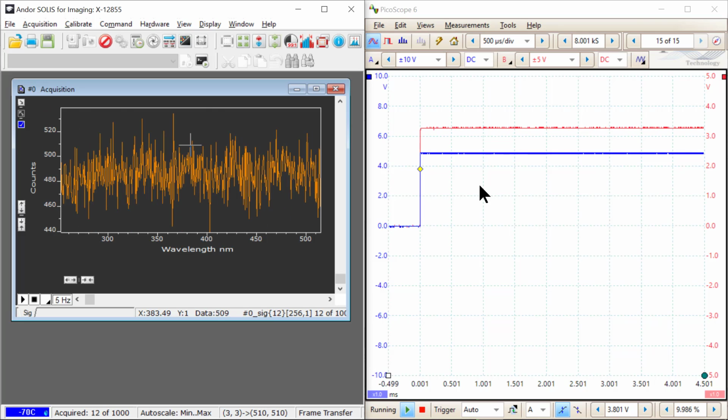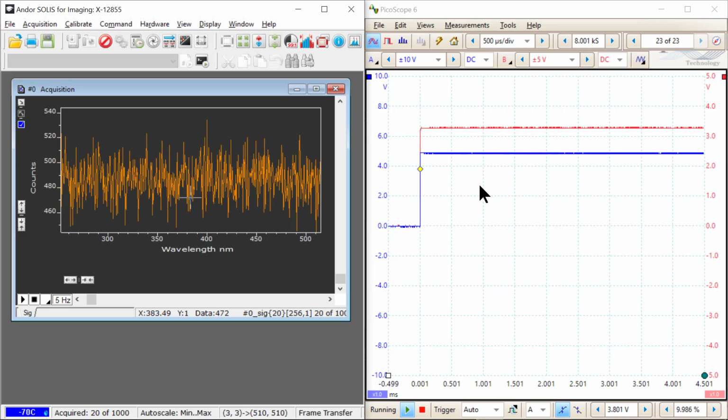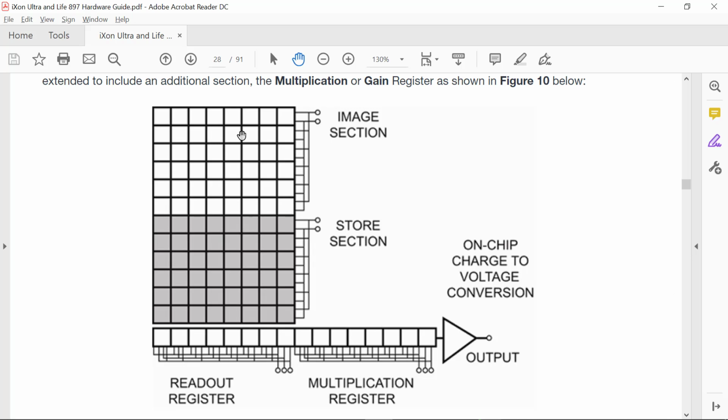Why is that? Because I believe we have a keep clean cycle happening, and what this means is that at the beginning of the sequence of exposures, so let's go to here, the camera is set to wait for a trigger. So I'm beginning my measurement. So the camera says, okay, I'm waiting for a trigger. It could be waiting for a week. The camera doesn't mind. And if my phenomenon isn't happening until that time, it'll just patiently wait for that trigger.